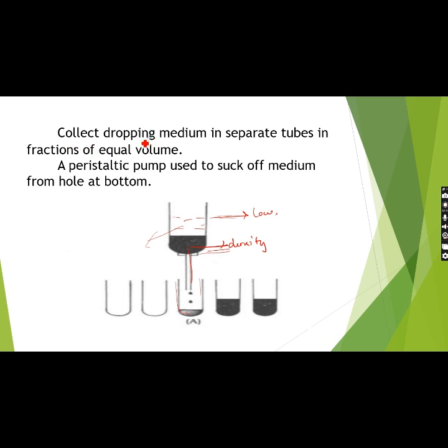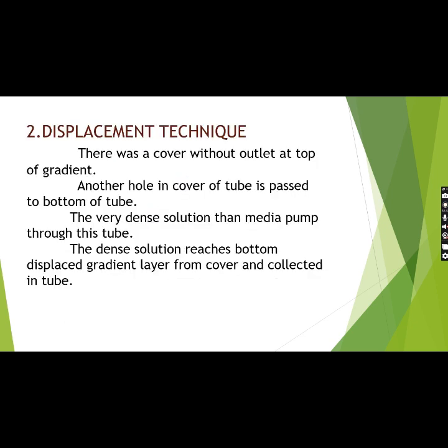A dropping medium which consists of components similar to the cell components or biomolecular components can be used. A peristaltic pump can also be used for sucking the medium from the hole. Clogging can be possible otherwise, which is not possible if a peristaltic pump is used.